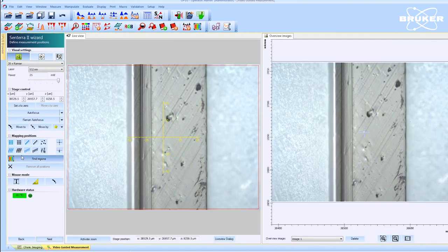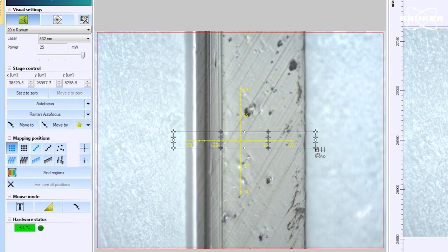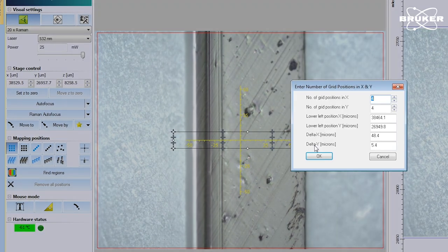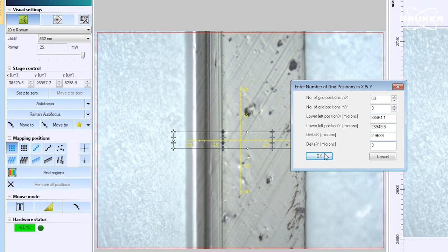Next, we define the Raman parameters and measurement positions. Across the sample, we create a tight 50 by 3 grid with a measurement point each 3 micrometers.